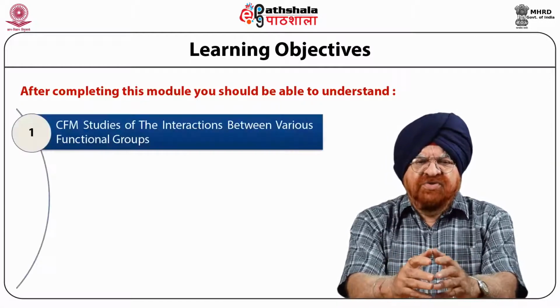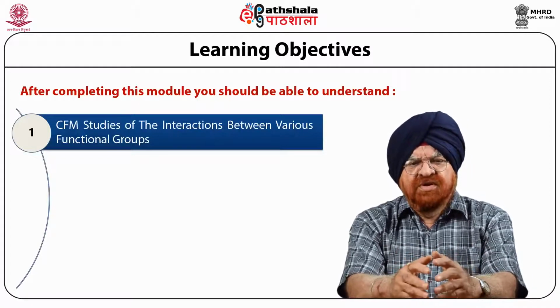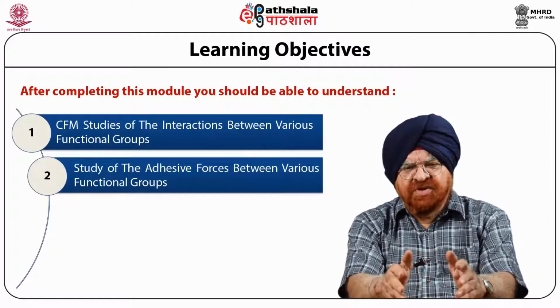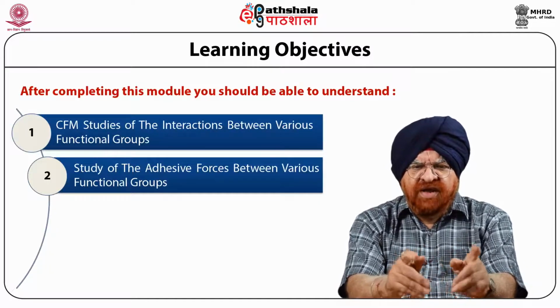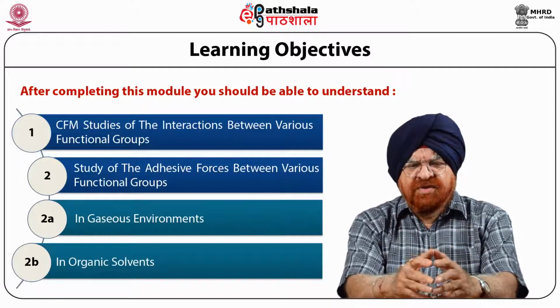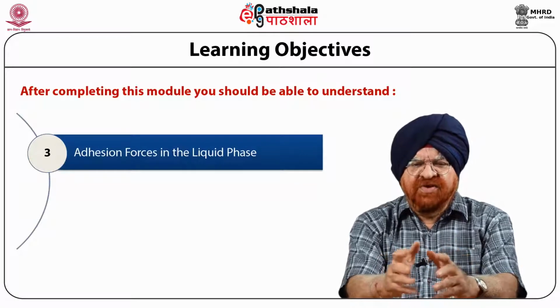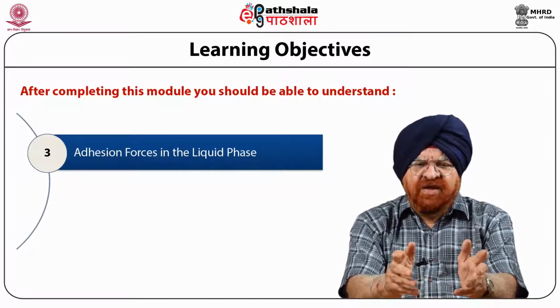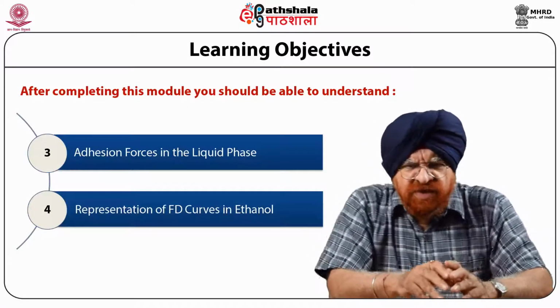That is, CFM studies of the interactions between various functional groups, studies of the adhesive forces between various functional groups involved in gaseous environments or in organic solvents. Then we'll come down to adhesion forces in the liquid phases, and finally representation of these FD curves in ethanol.